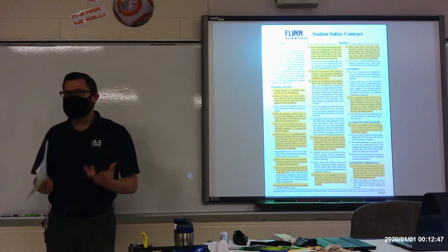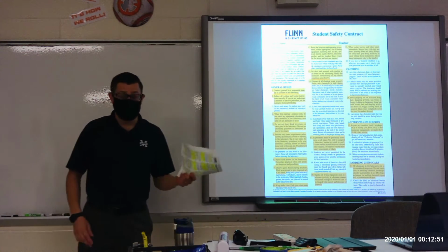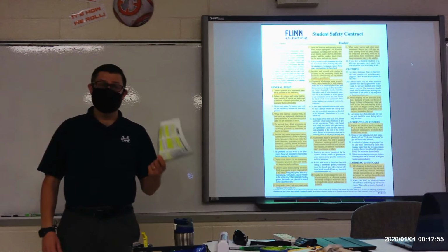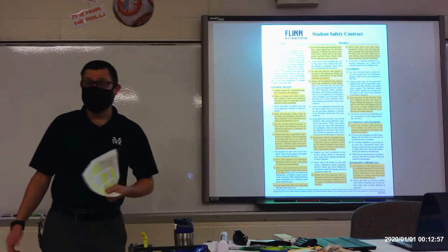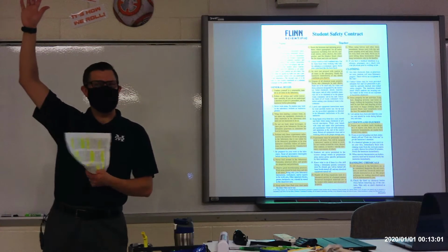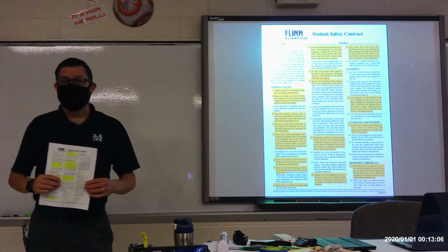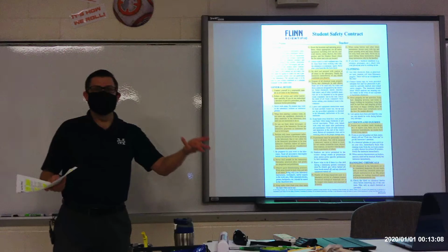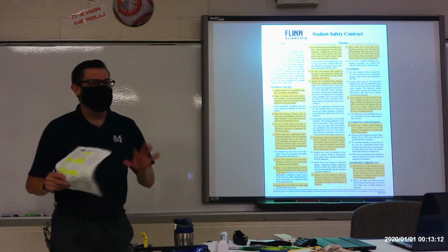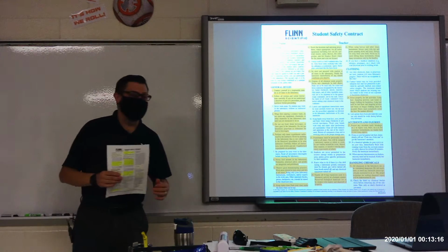I mean, most of the experiments that we do in here, again, not terribly dangerous, but if you don't know, then don't do it. Now, if you're curious about something, it couldn't hurt to ask. I've had students do that before. It's like, Mr. Wassman, what would happen if I did this? And I might say, go ahead and try it, because I know what the results will be. Again, I've done most of these labs before, so I'm pretty sure that I know what would happen. And if I didn't know what was going to happen, I wouldn't let you do it.